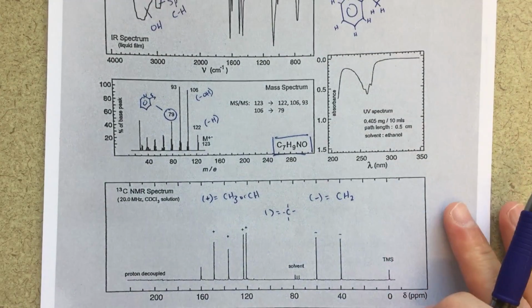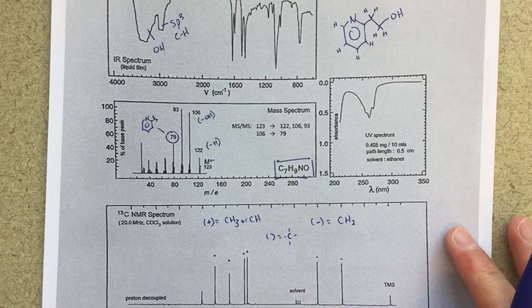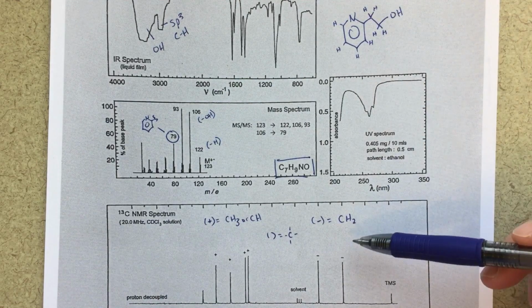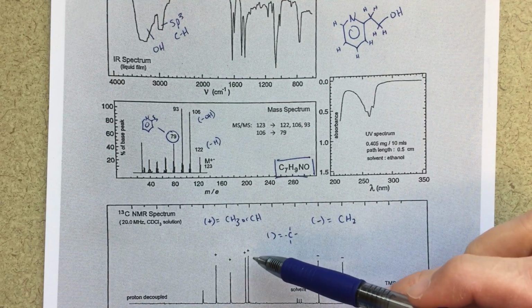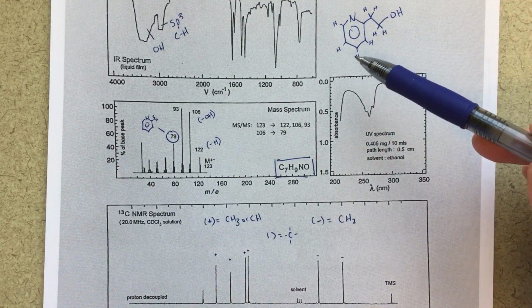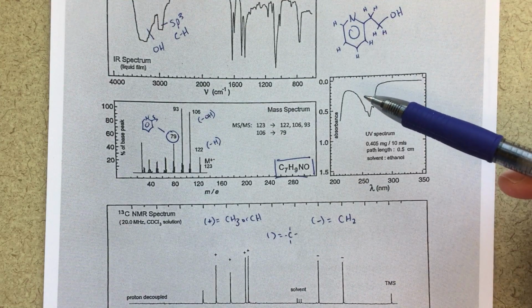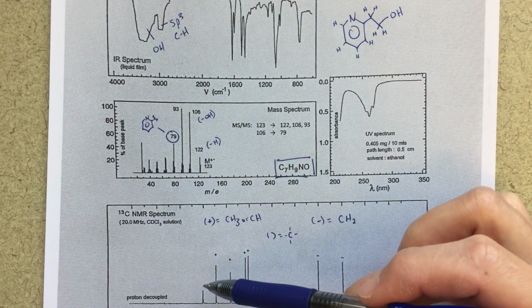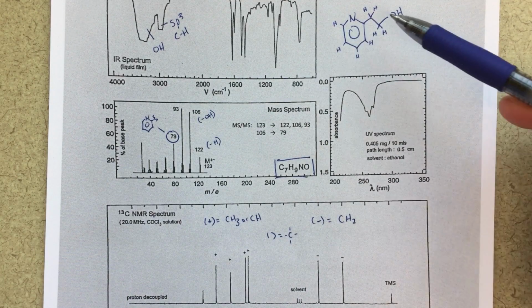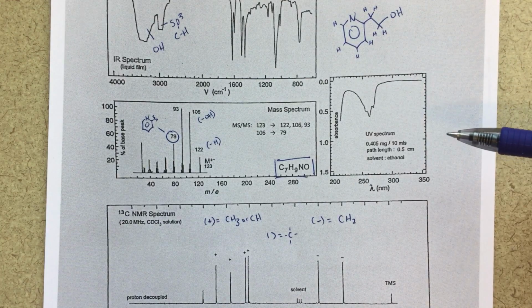So I think that if we look at our structure, I've got 2 CH2s, so these 2 CH2s will be here. I've got 4 distinctly different peaks in my aromatic region that will be my 4 different aromatic protons. And then this other one here, that would be this carbon, this point here with no hydrogens bonded to it. So I think that all matches and makes sense.